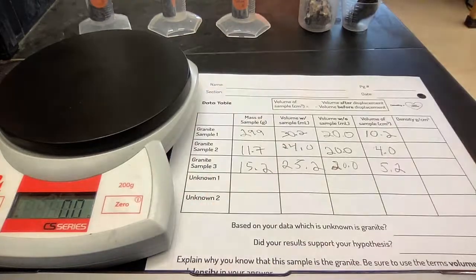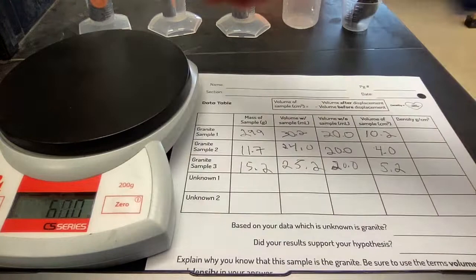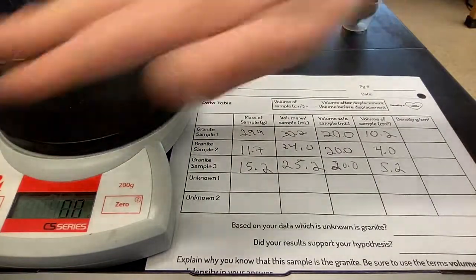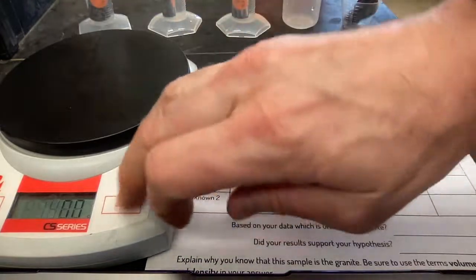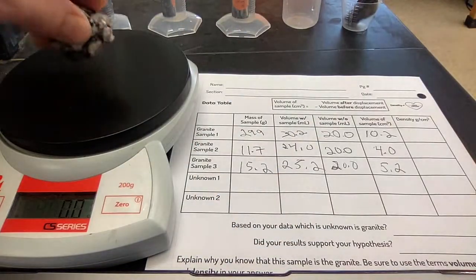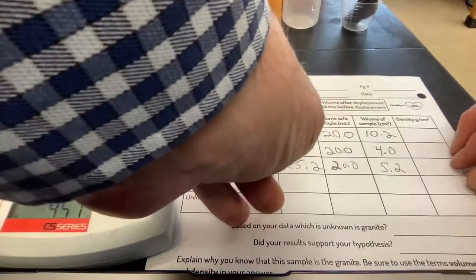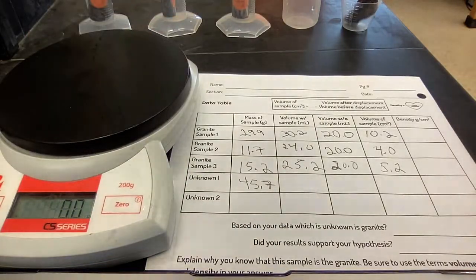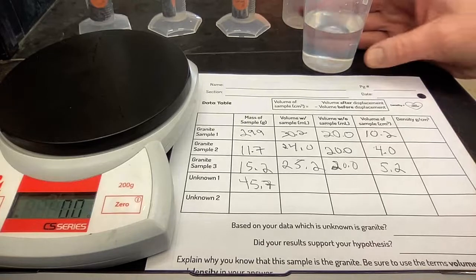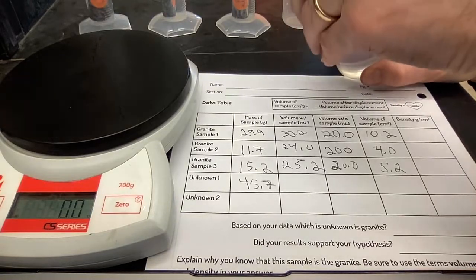rock. I'm then going to measure the... it's a little wet. This might change my outcomes a little bit. I'm concerned about that, but I'm going to forge ahead. The mass of unknown rock number 1, 45.7 grams. I will then submerge it in what I've already measured out to be 80 milliliters of water, 80.0.